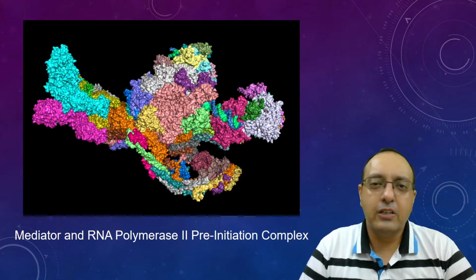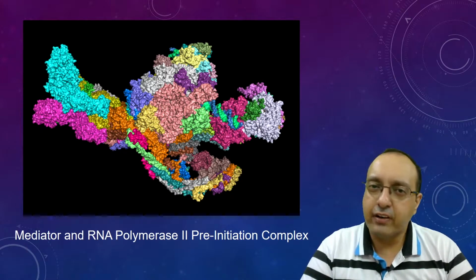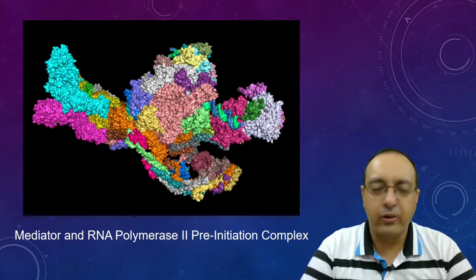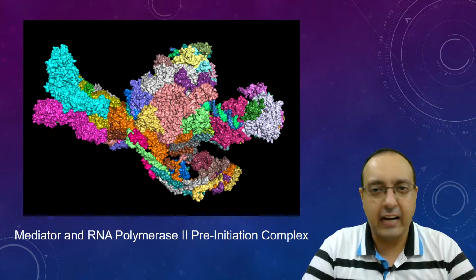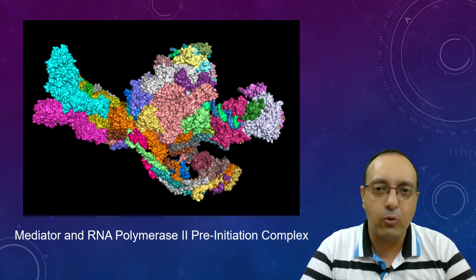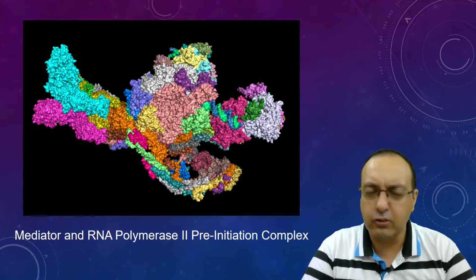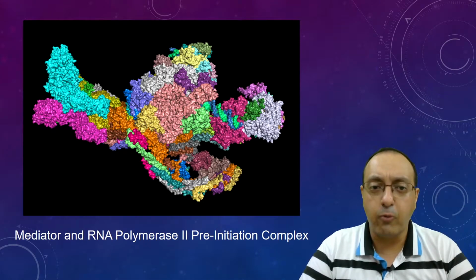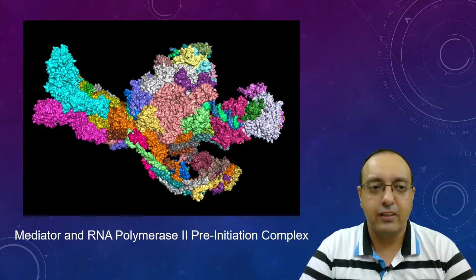Now, evidence started to emerge in the 1980s about the importance of protein-protein interactions. Many different enzyme complexes and macromolecular assemblies, like RNA polymerase, DNA polymerase, replisome, spliceosome, began to be characterized in the 1980s and 90s. And it was realized that these are not individual proteins or a few proteins, these are macromolecular complexes with multiple interacting proteins. Here you can see an example of the mediator and RNA pol 2 complex, and this is just a small snapshot of what actually happens.